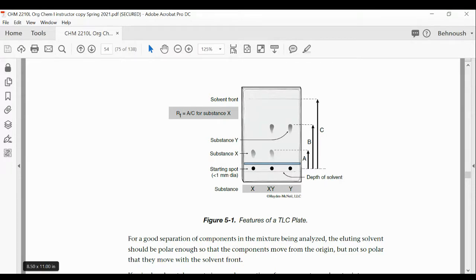What's going to happen in that case is that the sample is going to wash out. They are going to dissolve in the solvent. So now you have a solution. You don't have a solvent moving up. You have a solution. Of course, your sample is in the solution. So when it moves up, it's going to separate, and it shows you different layers.